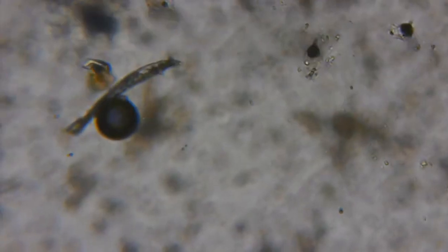Now each cell does actually have two chloroplasts full of chlorophyll, the green pigment, but most pigment in that cell is xanthophyll, which is why it's so yellow. And I really do love watching these tumble through the water because you can really see the 3D nature of them under the microscope. In real life though, you'll know a pond's got these in because they absolutely stink.